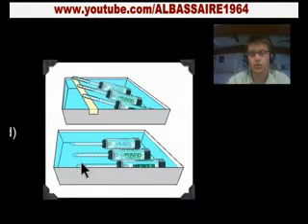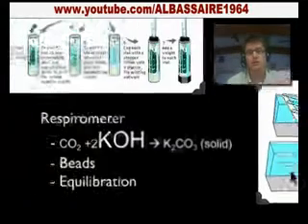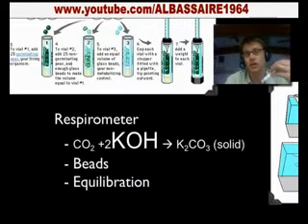We then put them underwater, and then we're going to watch the water bubble move in. Now let's go through some of the important things that I just mentioned. First of all, KOH, or potassium hydroxide.